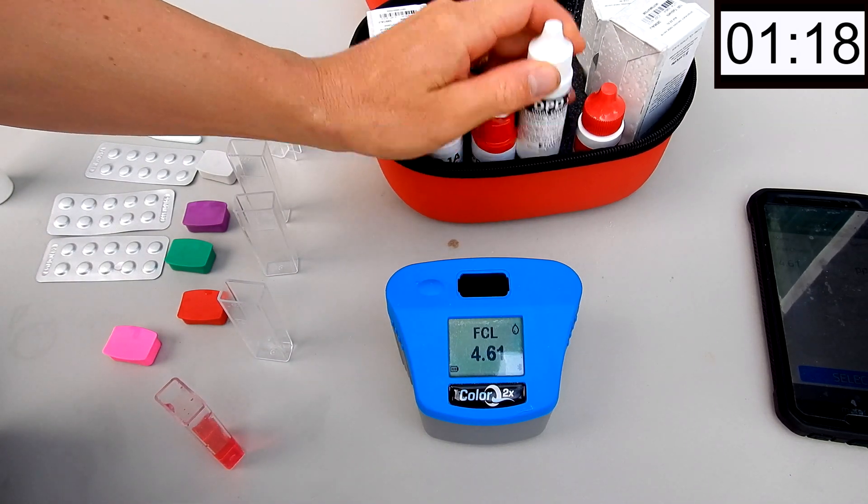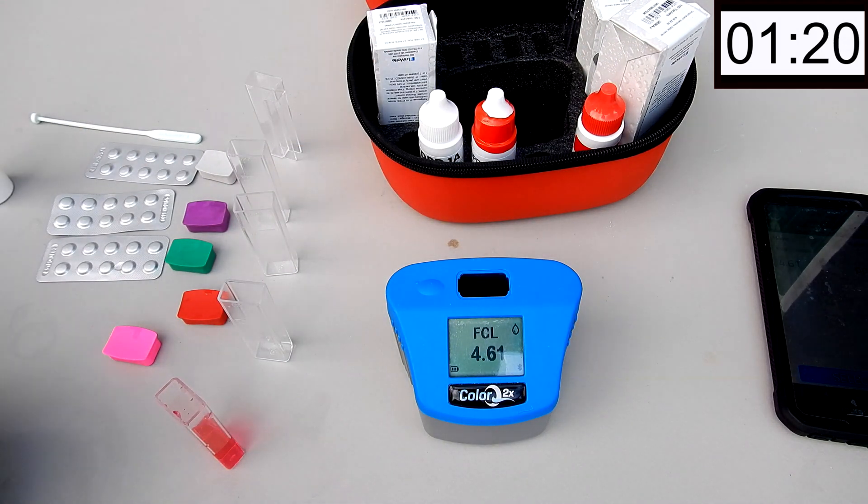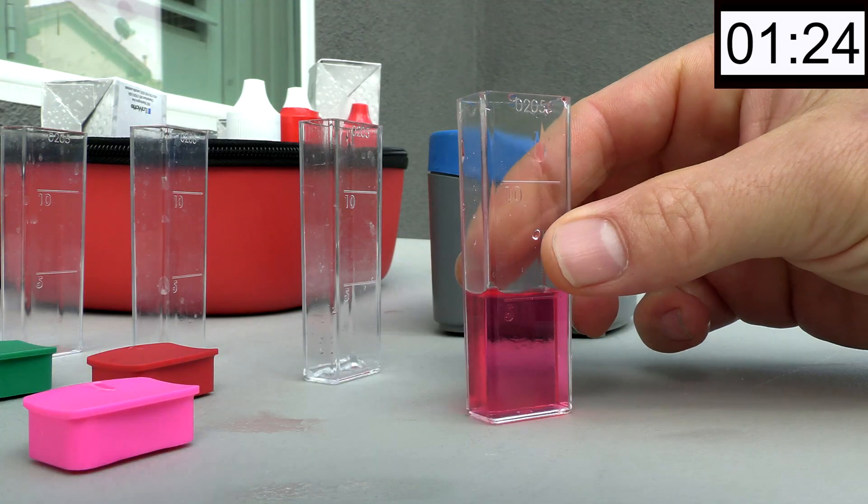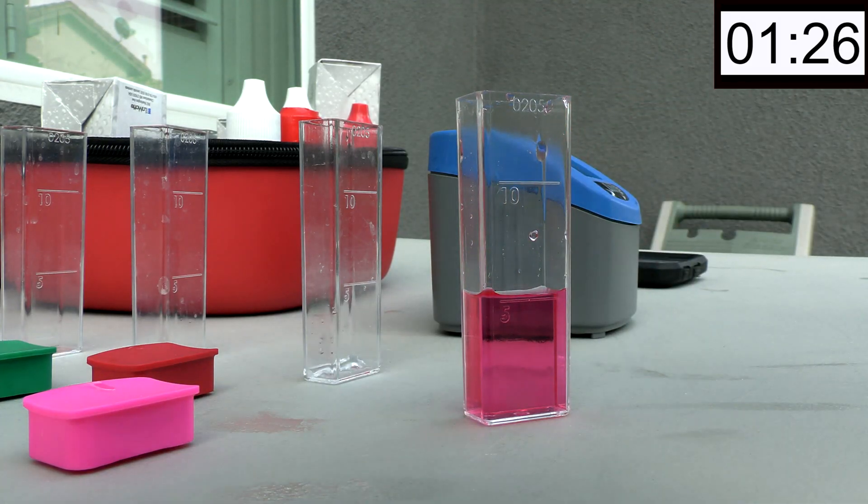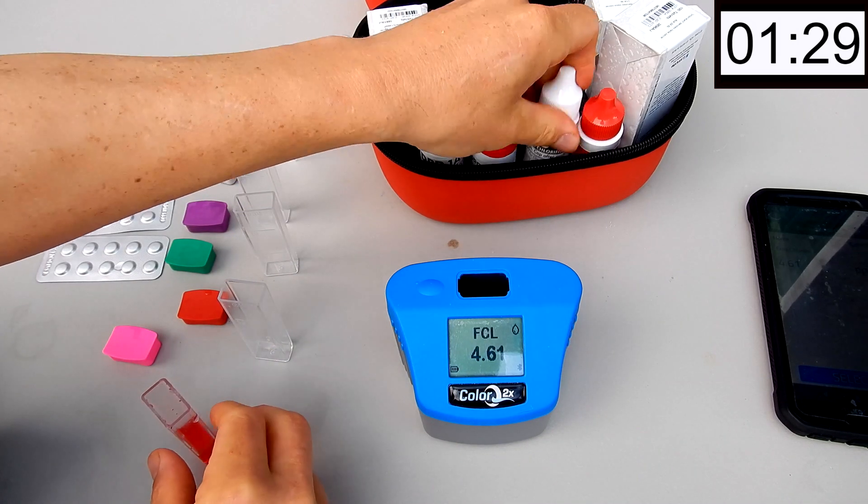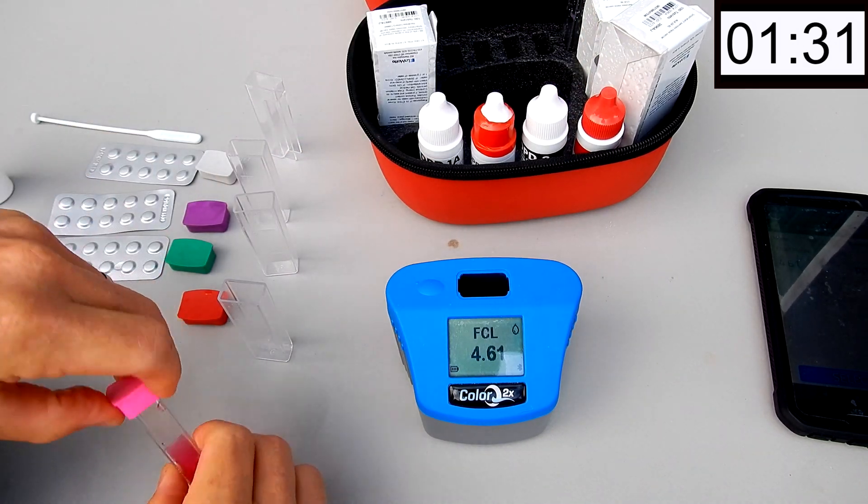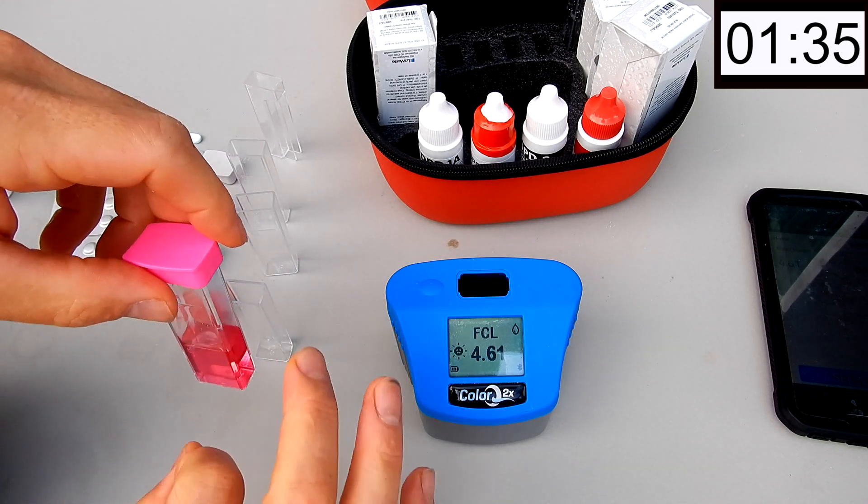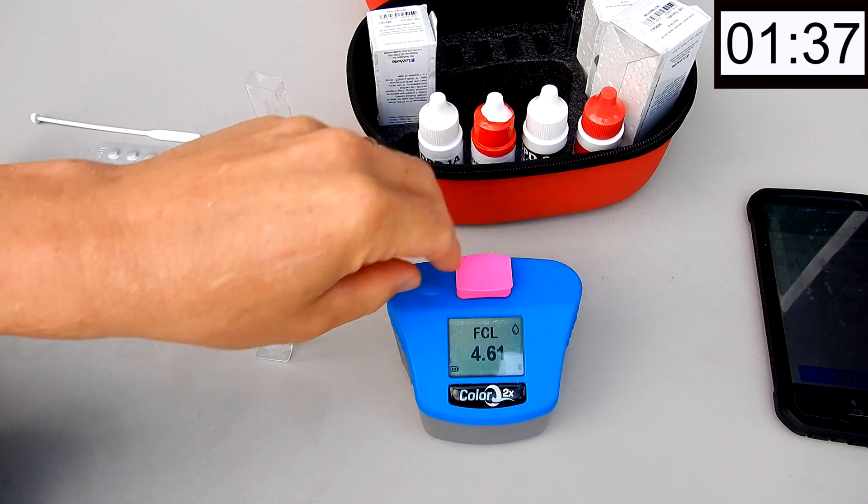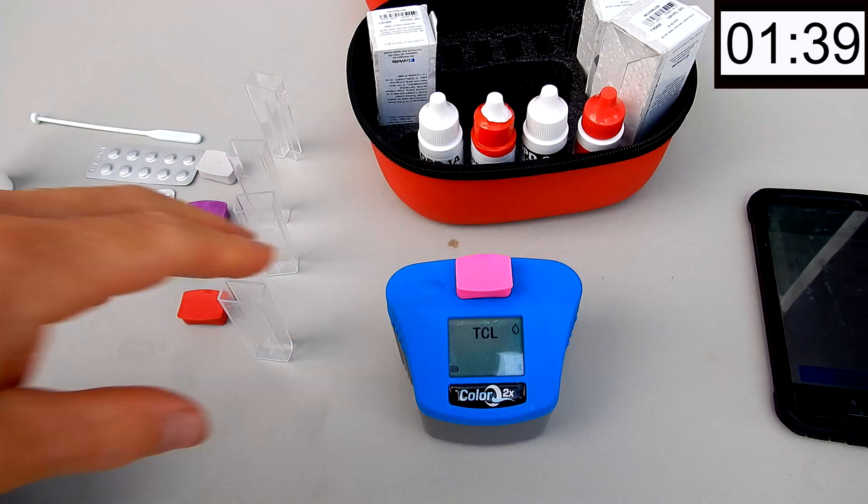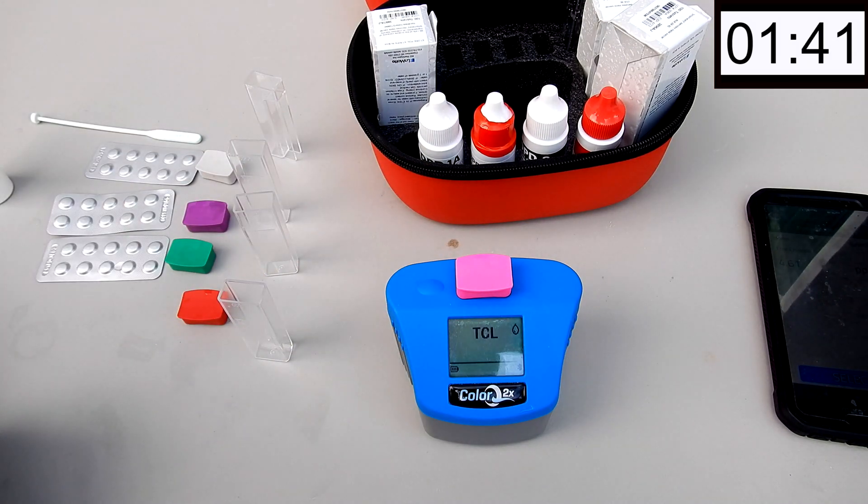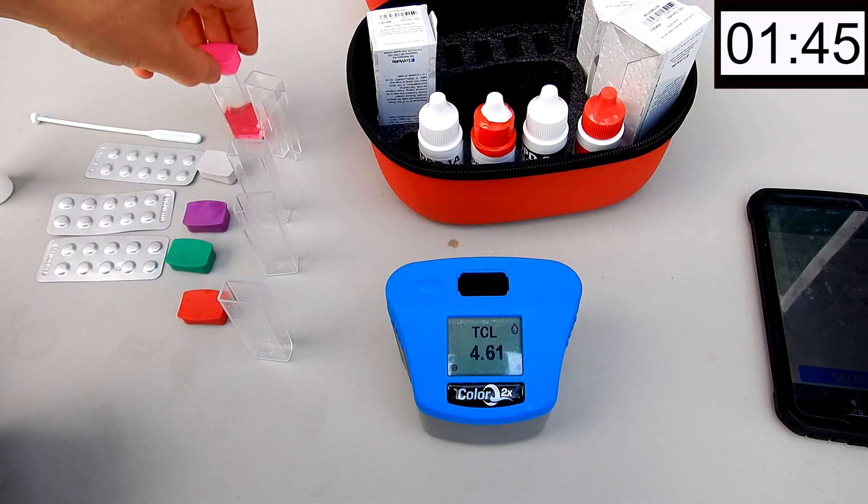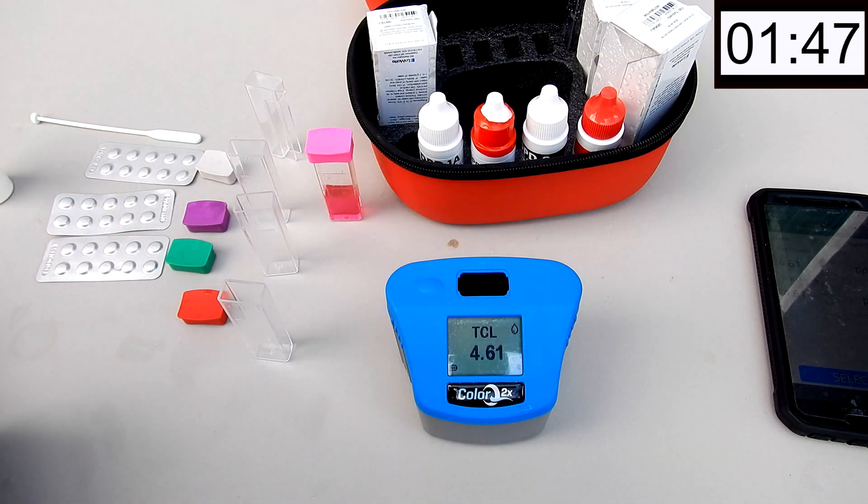Let me get the Combined Chlorine here. Then you would add 5 drops of the DPD-3. We're going to tap for the release of any air bubbles. Put that one over there.